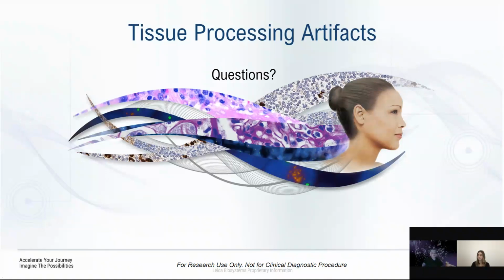Like I would think that if it's at the end of the bottle, where you tend to see some buffers come out right at the bottom. Maybe if you left it in there a long time, but this is a new one. I don't know. I think it depends on the time, depends on the contents of the bottle. Is there a lot of buffer sitting in it? And is it circulating through that tissue? Is it a tissue that's very porous that would allow that to come in?